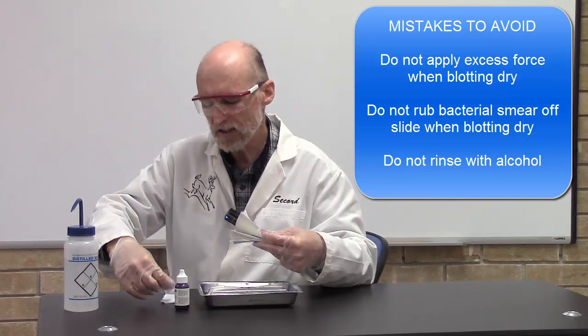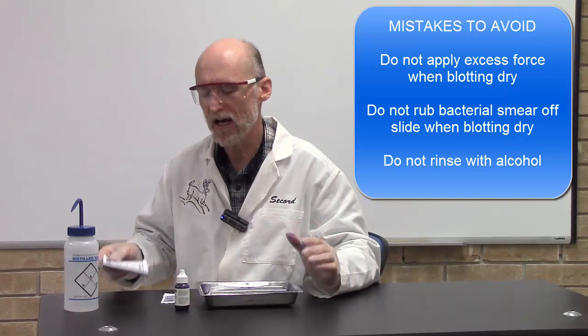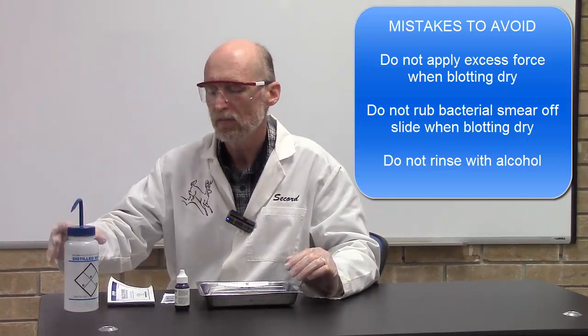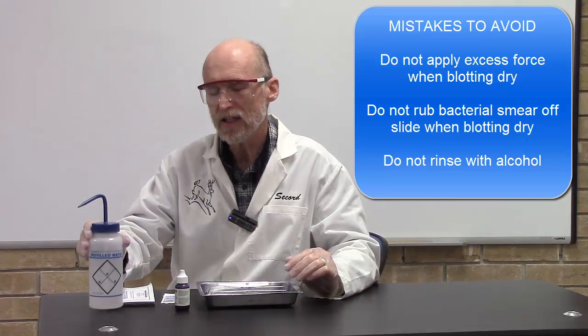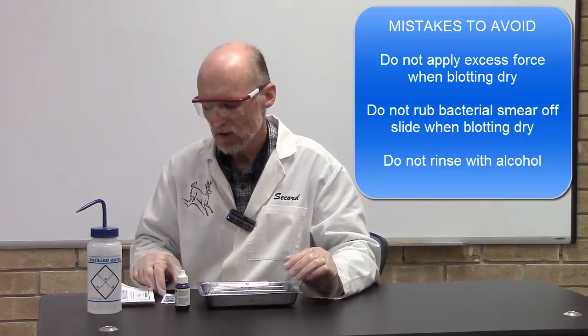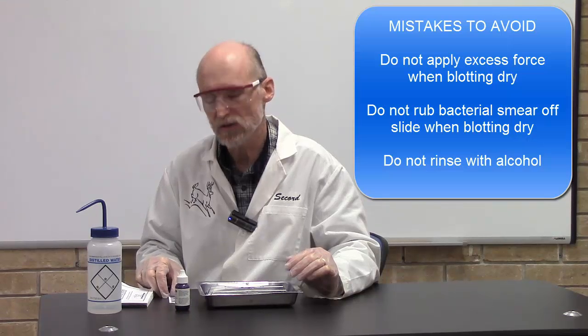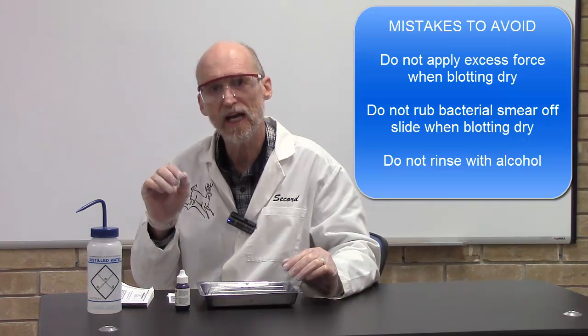And finally, and this doesn't happen very often, but I have seen it occur once or twice, make sure you're rinsing with distilled or deionized water. If you accidentally pick up your alcohol bottle, you'll decolorize your bacterial smear and essentially wash the stain right out of it. So there you have it. That is the simple stain technique.